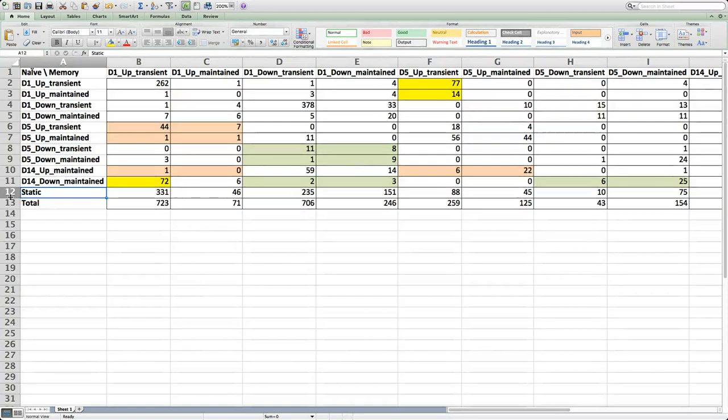Have you looked? I assume you're going to do GSEA on this. Yeah. Are you going to look at transcription factors? What about the transcription targets of transcription factors, is that part of GSEA? Yeah, that's part of MSigDB. So I can do that. So I could figure out if any of these signatures were driven by specific transcription factors in theory.